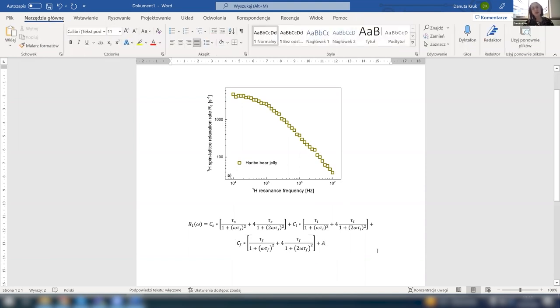So in principle, one could say that my first attempt could be to try to reproduce the data in such a way. Whether I will get a fit, this is a different story, and we'll try in a second. I did not try it before because I fitted something else. However, if we do, one can always say, okay, it does not have much meaning.